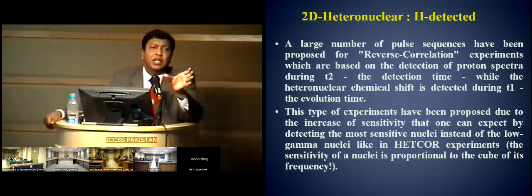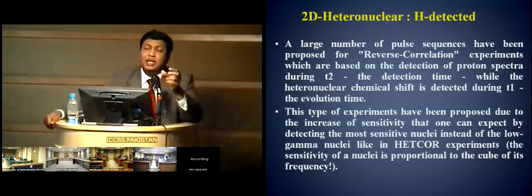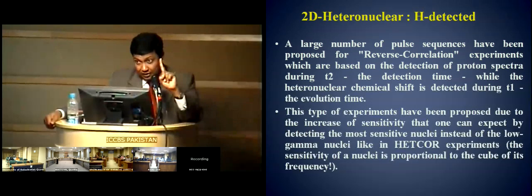during the mixing time, 180 Y pulses are actually used to lock the spins together, to bring them together by using a spin echo experiment. And in between the delta, you split them, then again put them together, split them, again put them together. So every time you lock them together, they cannot change their position. Right, the position which they obtained at the end of T1, kindly remember.